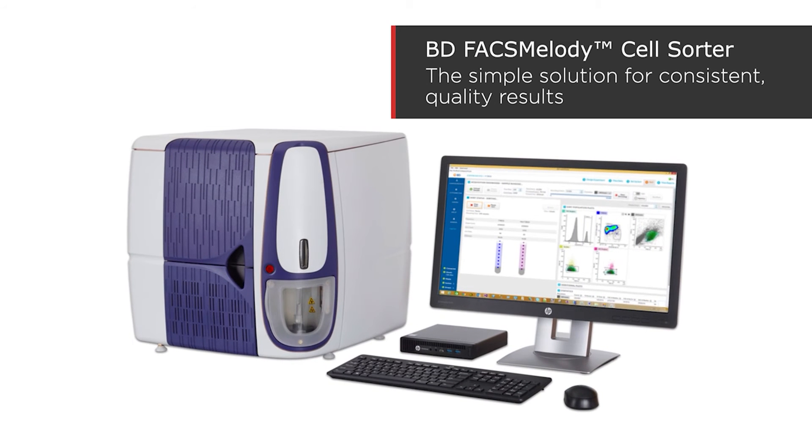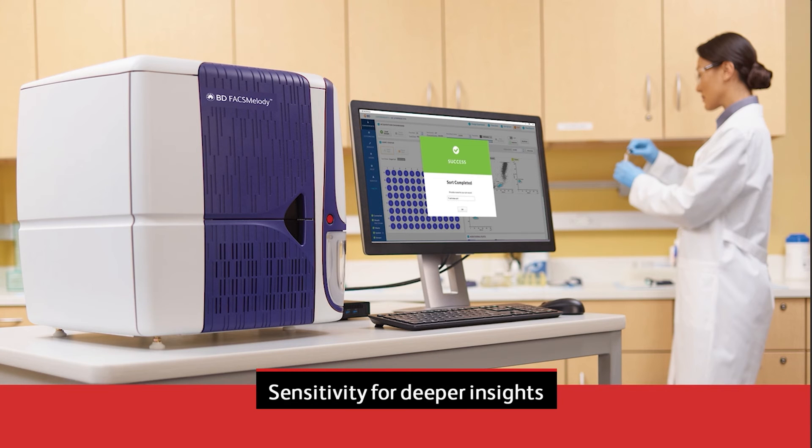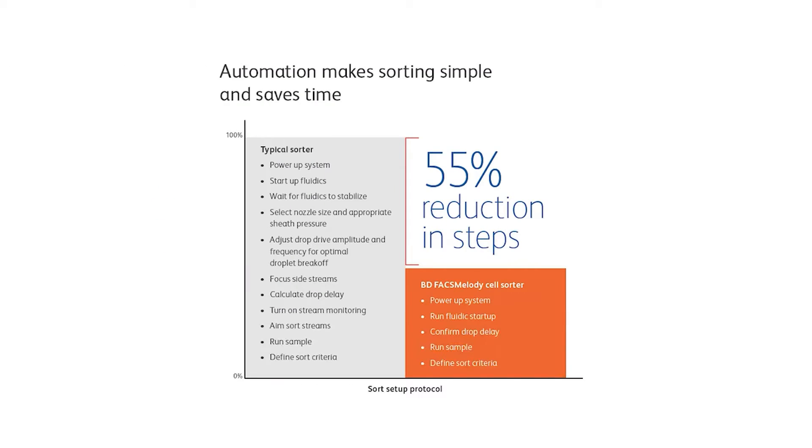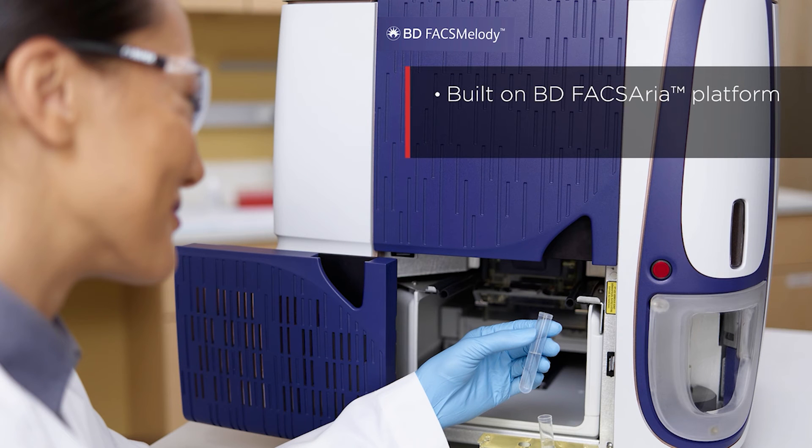The BDFAX Melody system was designed to make sorting easy for anyone in the lab while providing sensitivity for deeper insights into your cell samples. Loaded with automation features to streamline your workflow, it reduces the number of manual steps typically required by other sorters by 55%.